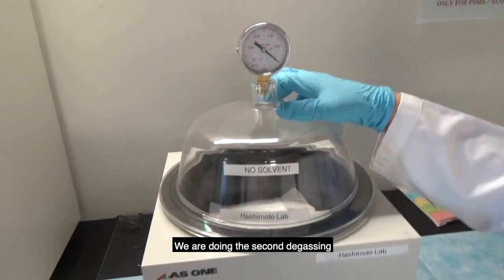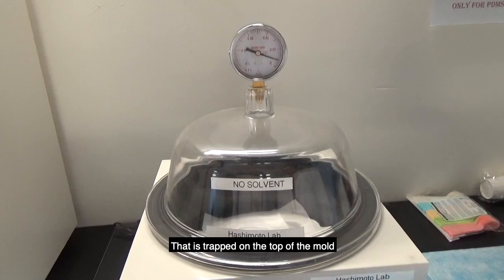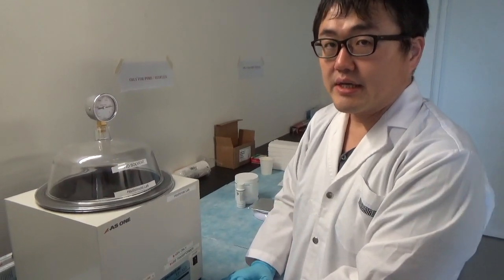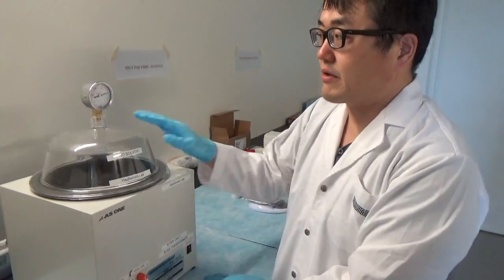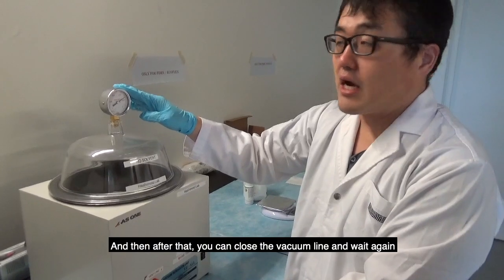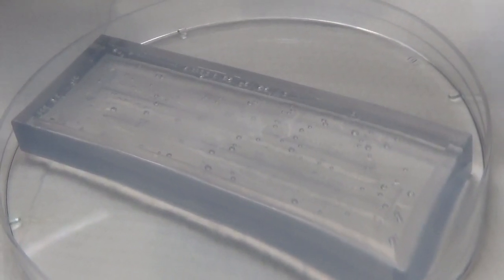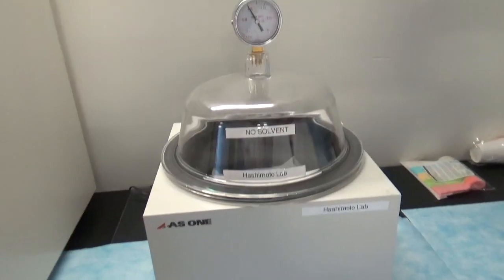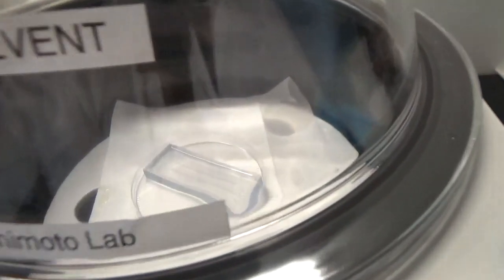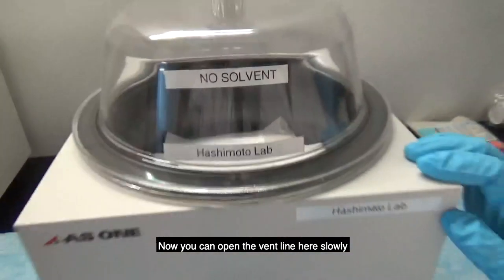This second degassing will remove any bubbles that are trapped on top of the mold. After a while, all the bubbles will rise again. Wait until the reading reaches minus 0.07, then close the vacuum line and wait again. After most of the bubbles are gone, take a look inside — now most of the bubbles are gone. Open the vent line here slowly.